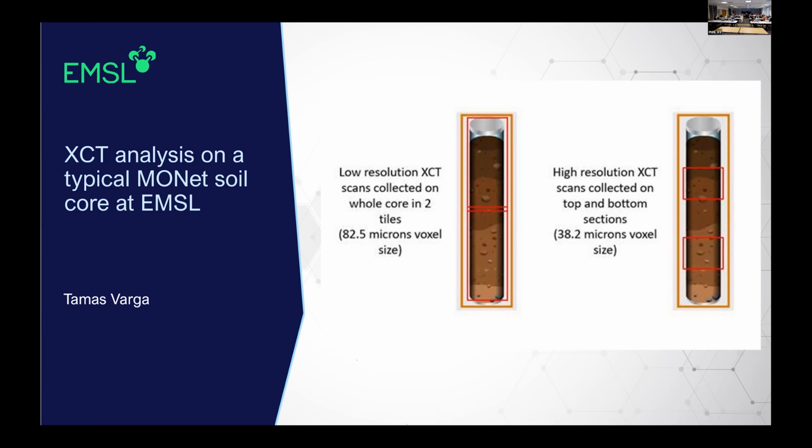Yes. That's interesting to hear about their application for roots. The MONet cores are intact cores, right? So are we also scanning the roots in them? It seemed like no from your presentation. Are they removed? We are scanning them, but haven't been extracting them. So we're focused on the porosity.